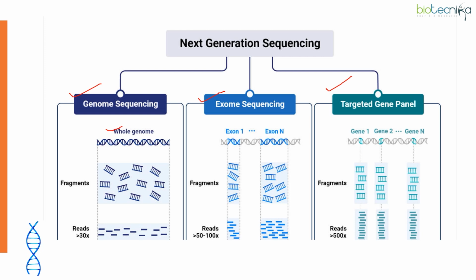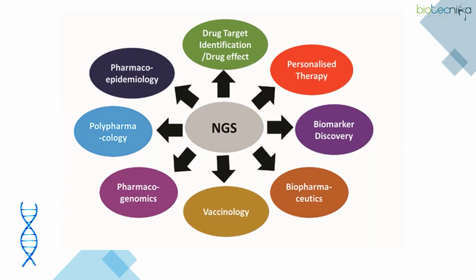Got it? So as you can see, after you get the FASTA-Q file, it will be available in the databases of the bioinformatics platform, right? From there we download the FASTA-Q file and then, using the command line in the bioinformatics platform, we process the FASTA-Q file in the standard pipeline, and followed by that we get the BAM file and the VCF. And finally, in the VCF file, as we have discussed earlier, we will get the different variation information for our target of interest.